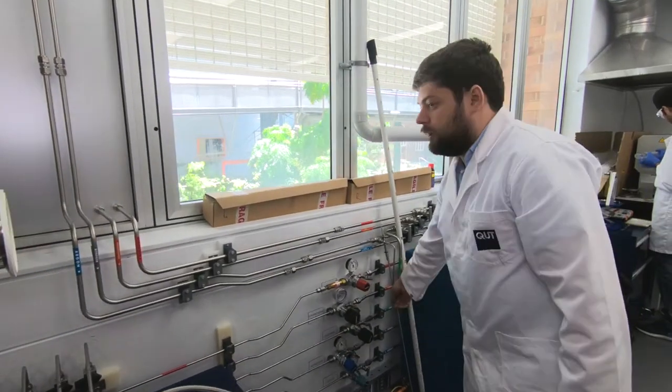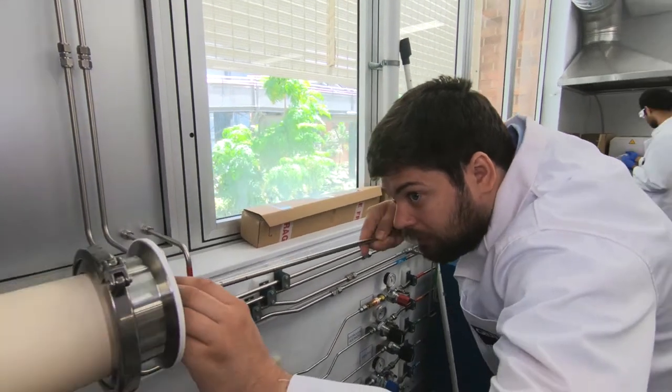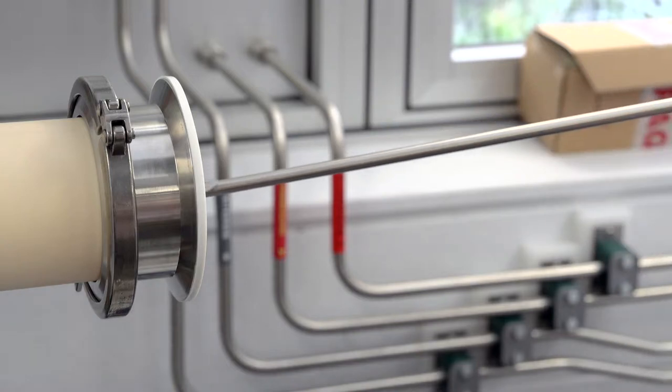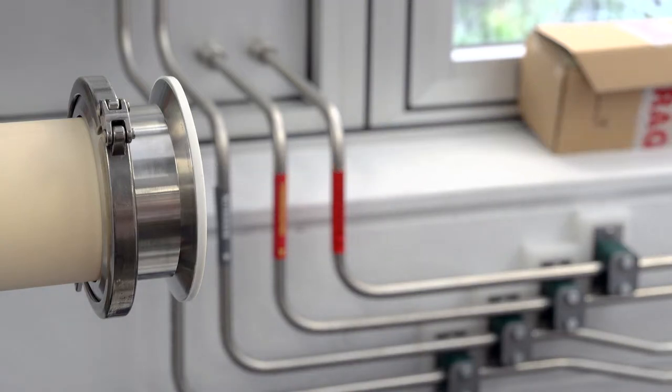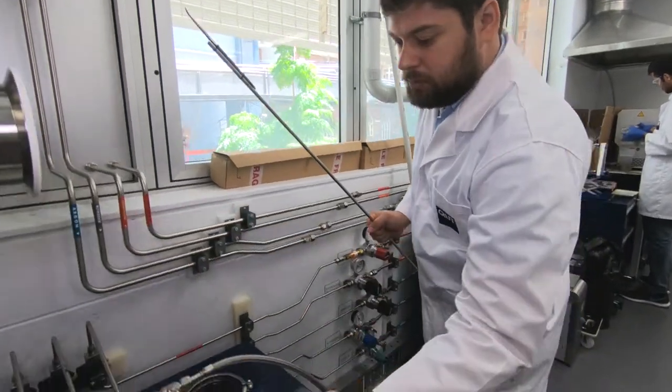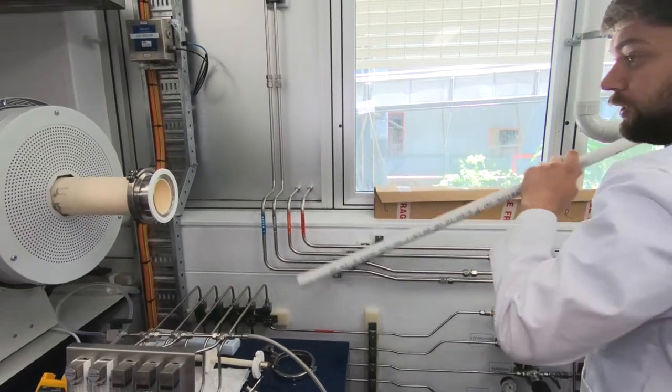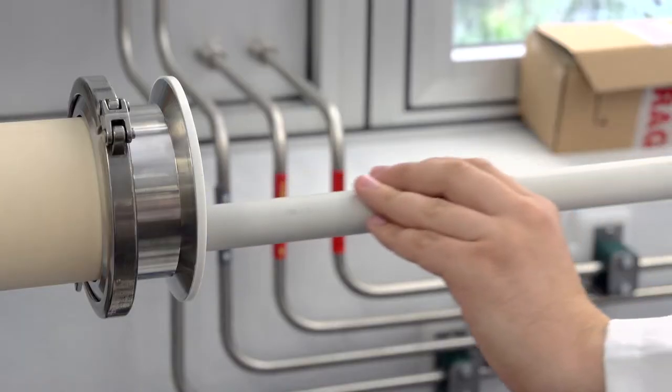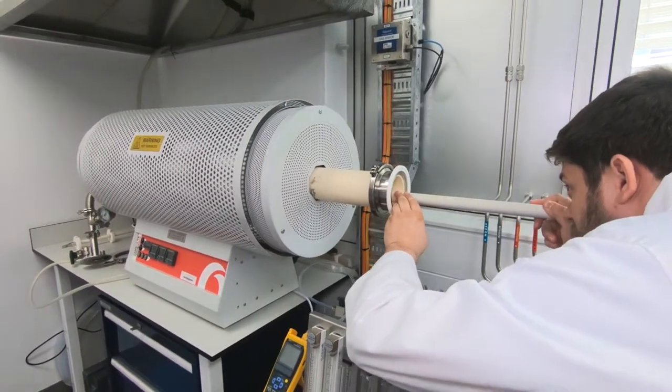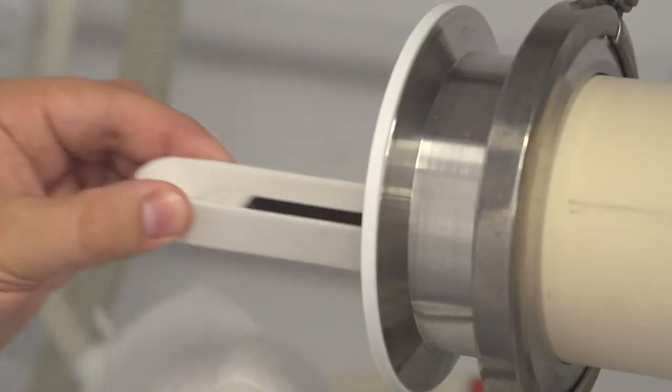Now we can take our samples from the furnace. We need to do it carefully because it's very easy to spill the powder. First bowl we just tilt like this, and second one we push through the furnace to the other side.